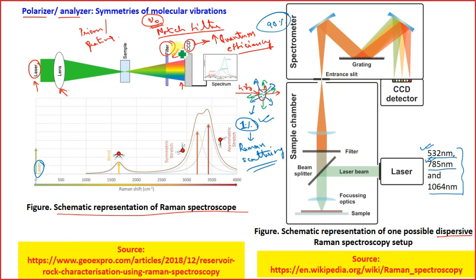The sensors sense the charges, the photons, right? So they will not be able to distinguish between the Raman scattering and the fluorescence photons. Yes, fluorescence photons, not scattering. So if the sample is fluorescent in nature, the detector will not be able to distinguish between the Raman scattered photon and the fluorescent photon, and the fluorescence will interfere with the sample analysis.